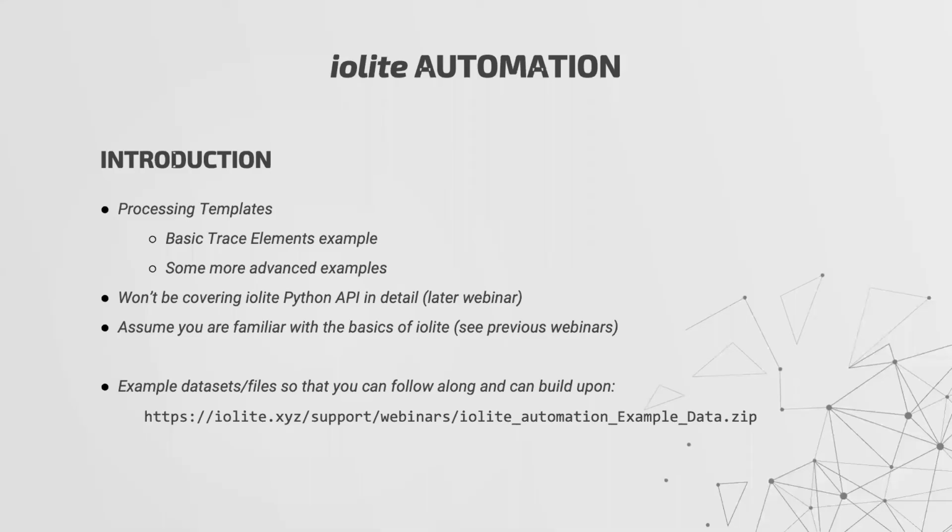Just to let you know, we won't be covering the Python API in detail in this presentation. It's too large and it'll be the subject of its own webinar. And we do assume that you're familiar with the basics of iolite. If you aren't, then we recommend seeing the previous webinars.